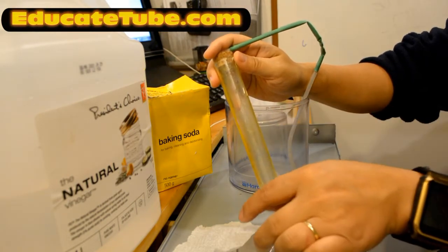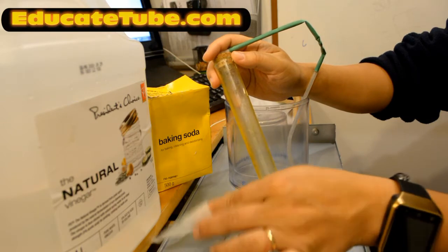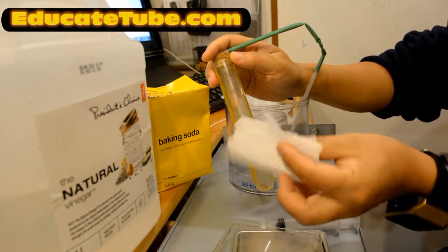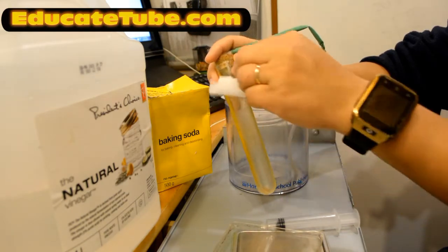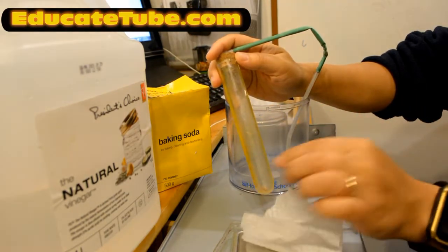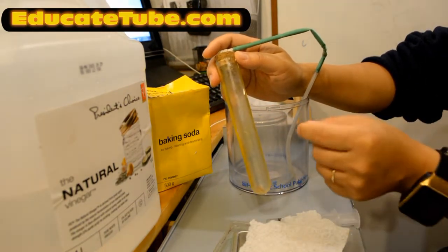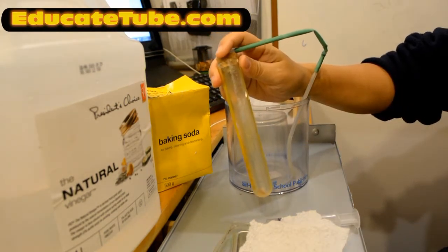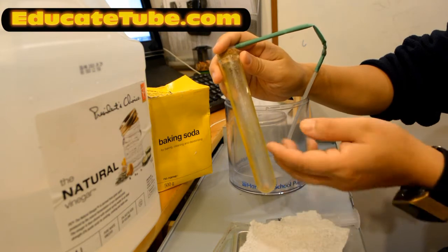Now when the reaction does occur, let's say I put in the acetic acid, 20 milliliters, and then I'm going to put in the sodium bicarbonate, the baking soda. I'm going to put a tissue into a little ball, and attach a string to it. I'm going to lower it down because I don't want the reaction to occur right away. I want it to occur just when I close this stopper. And then once it's lowered down, the reaction will occur.